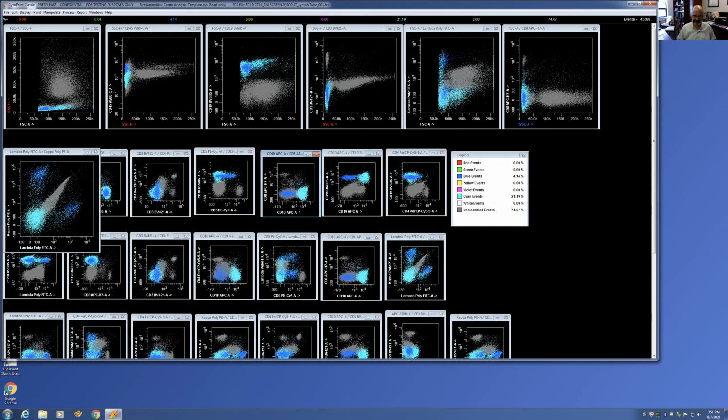So clearly this CD10, so I went in and painted all the CD10 positive cells together so you can get an idea of the entire population. And you can see that it's mostly surface immunoglobulin negative, but streaming into Kappa, Lambda, these are basically hematogones, right? These are developing B cells in the bone marrow, going to B cell school as they grow and mature into these blue mature B lymphocytes.